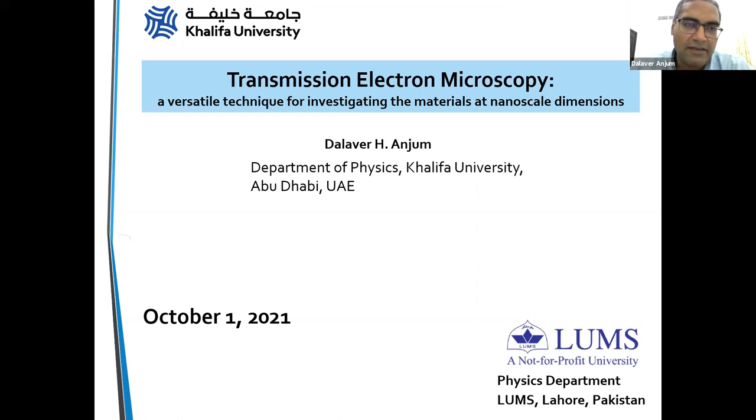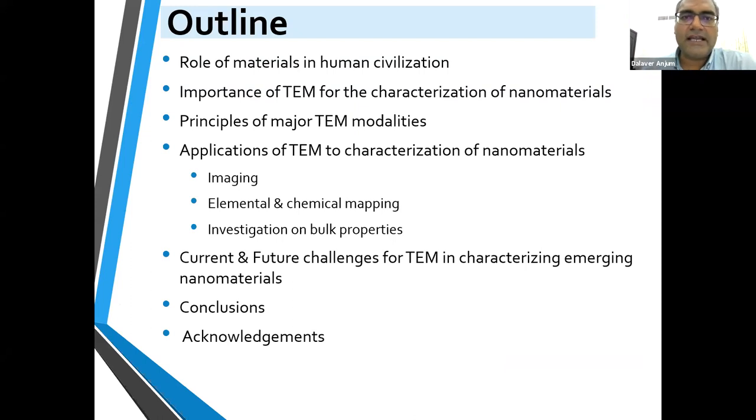I will give you some examples and show you some evolution of this technique and things like that. So with that, I start. As I said, I will try to cover these things in my presentation. I will go over why materials are important in our civilization, and then I quickly jump to the TEM, because after all, this presentation is about the TEM.